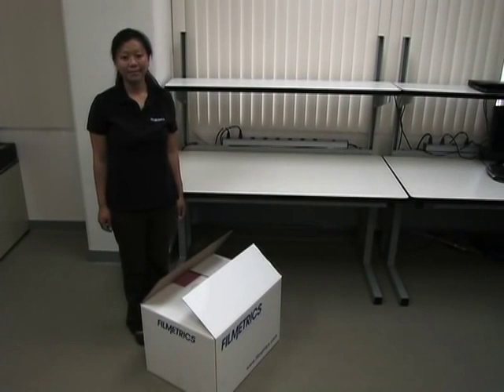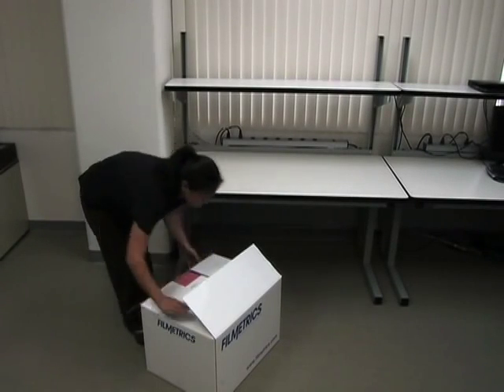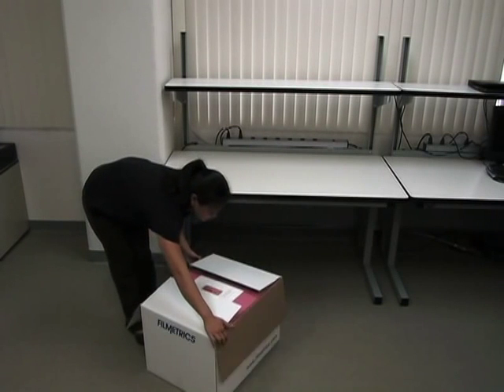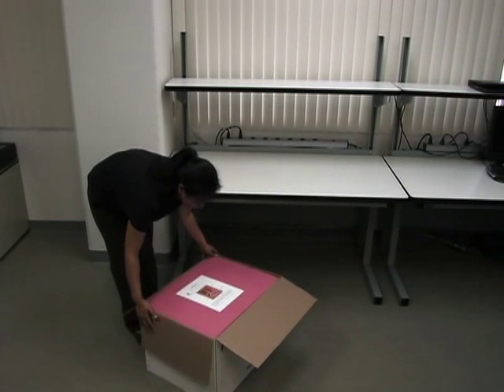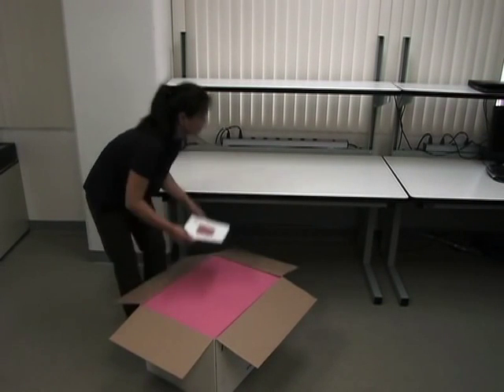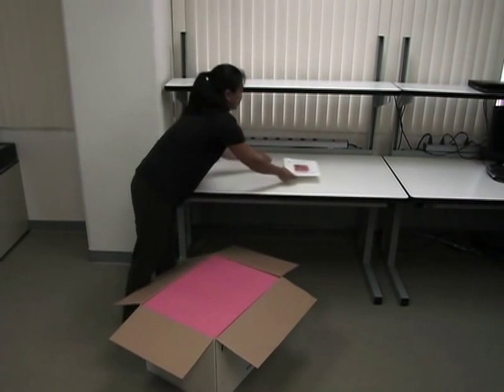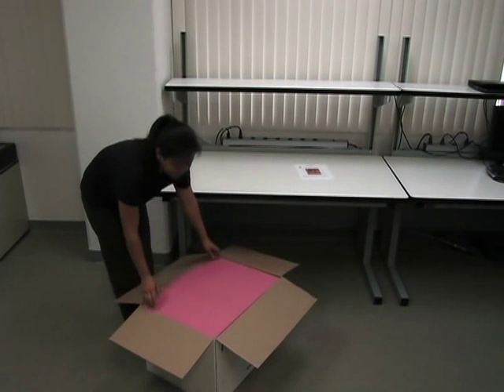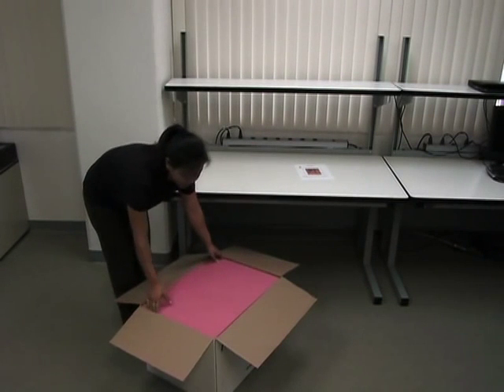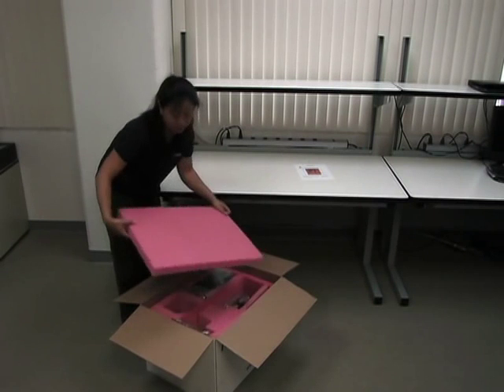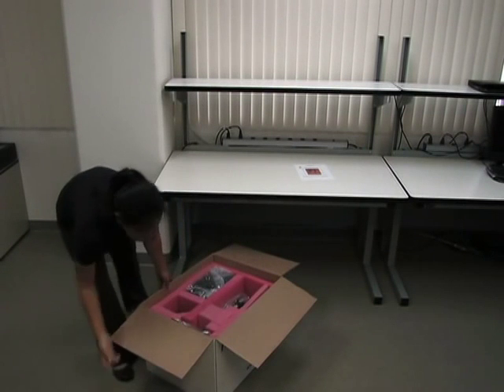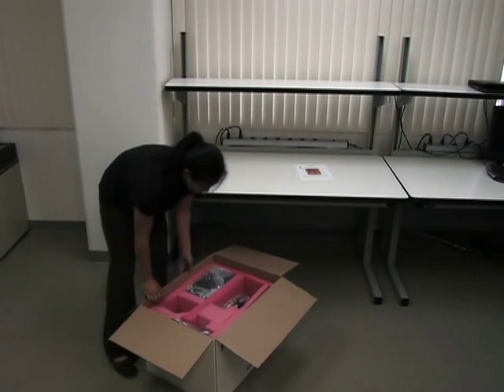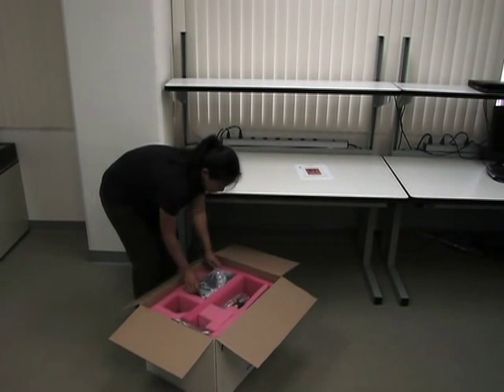Open the shipping box and review the packing instructions. Then remove the top layer of foam. Remove the F42 main unit.